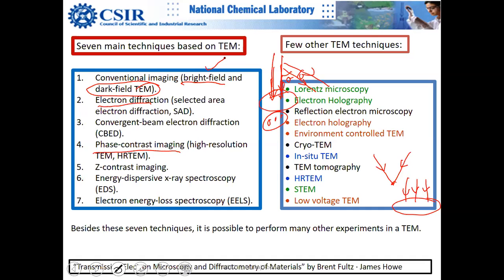When you are interested in knowing which element from the periodic table is present in the matter, what you do is bombard electrons onto an atom, so some of the core electrons are kicked out from different atoms.